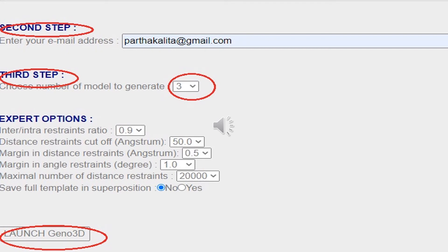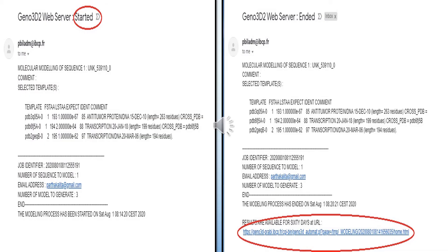There are some expert options, but you don't have to change anything there. Directly go to the 'Launch Geno3D' option and click it. In the next step, you will see your results in your email ID. After clicking the Launch Geno3D button, you will immediately receive one email stating that your Geno3D web server has started, meaning the program has begun.